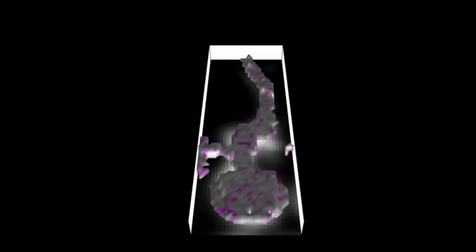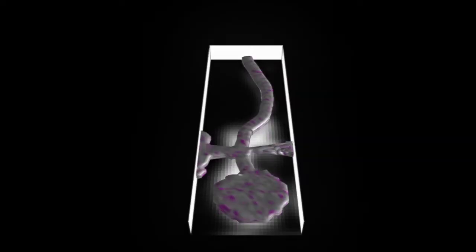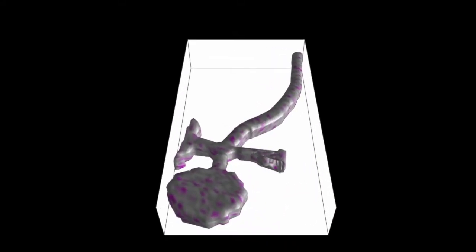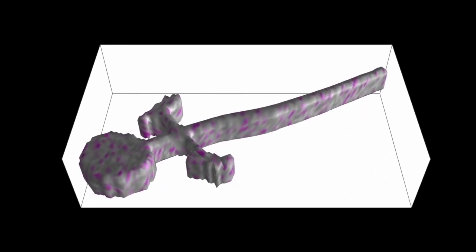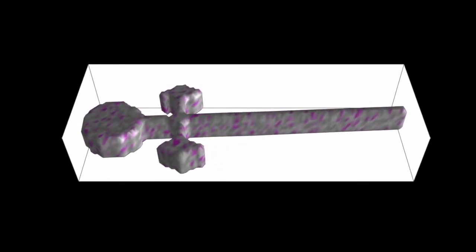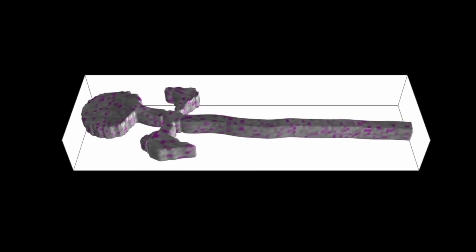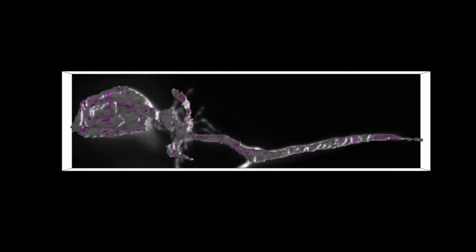Here we apply our method to align both input volumes with different spatial resolutions to the artificial template. For registration, we first map the low-resolution concentration map of protein interaction to the artificial template to recover the protein interaction level in the standardized coordinate system. The template is partitioned based on the topology with respect to the natural environment, shape, and function. Finally, we apply the inverse function to map the artificial template to the high-resolution GFP image and obtain the protein interaction estimation at high resolution.